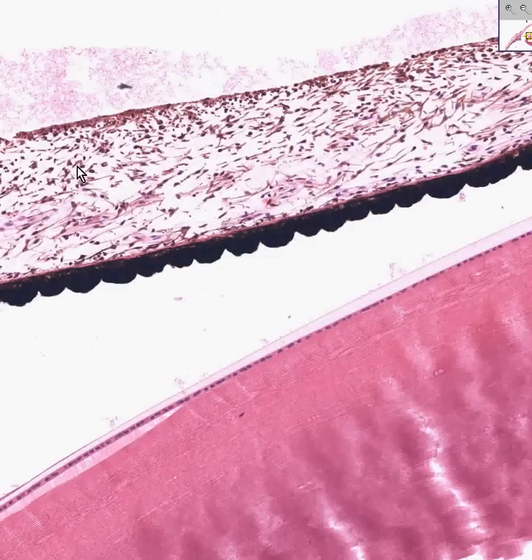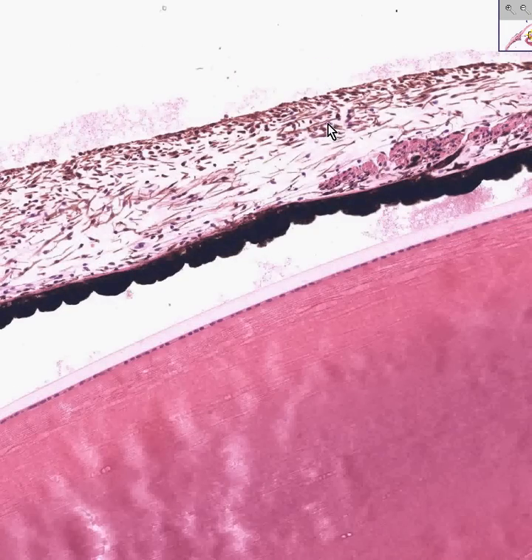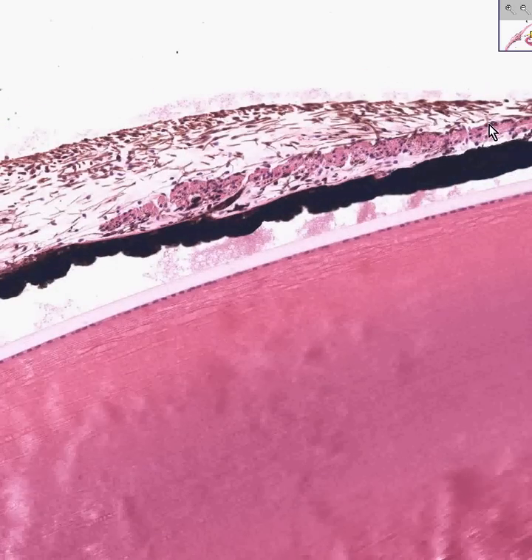But I guarantee you, when you look through these iris, and you see approximately here or here little strips of smooth muscle, you know that that has to be involved, geometrically speaking, with constricting of the eye, or pulling the iris to make that pupil wider. Whereas this little group of muscles near the very end of the iris are involved in constriction.